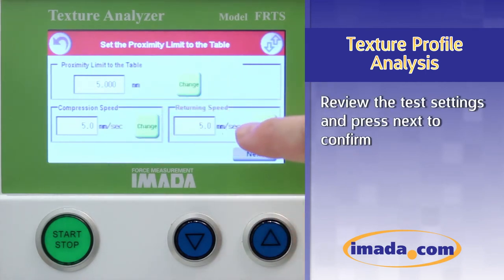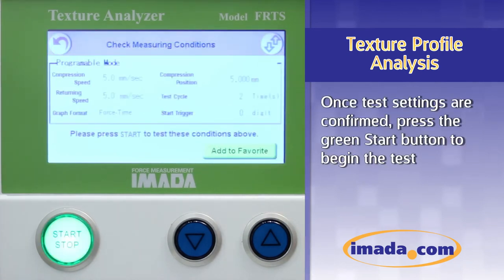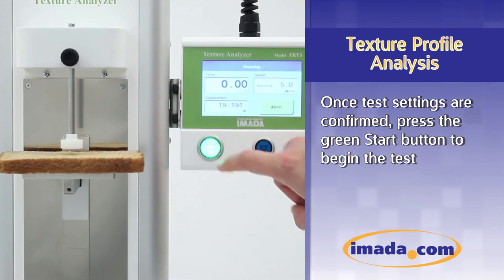Review the test settings and press Next to confirm. Once test settings are confirmed, press the green Start button to begin the test.